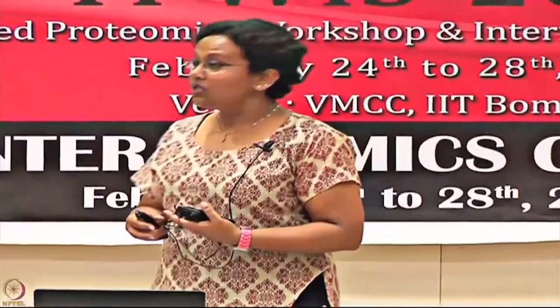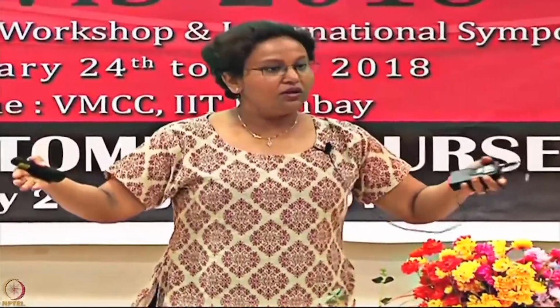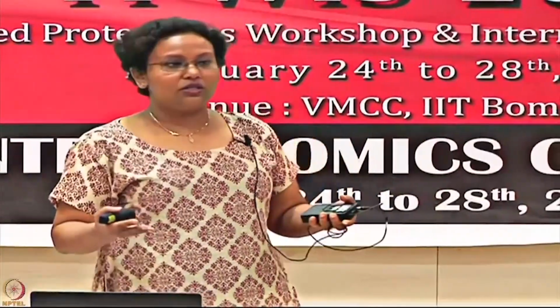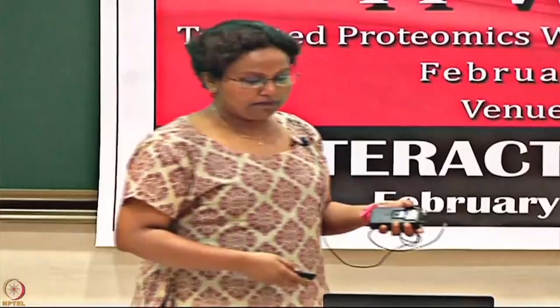And also injection time, we spoke about how much time it takes to run a full cycle, right. It is a very generalized question, because it depends on your association and dissociation that we understood, right. If it is a very quick associator and dissociator, you would obviously need a smaller time, and if you have a very slow association and dissociation, obviously the time needs to be increased.